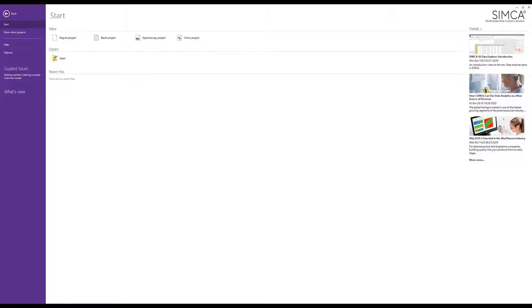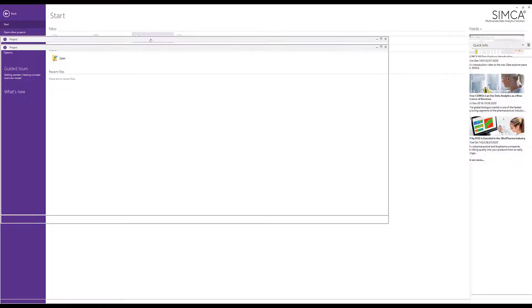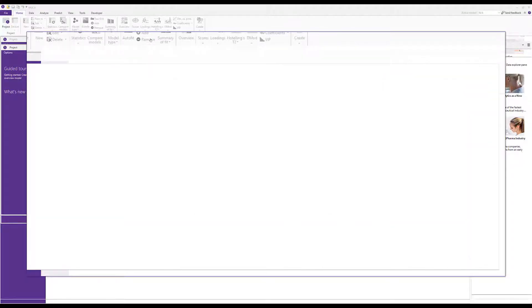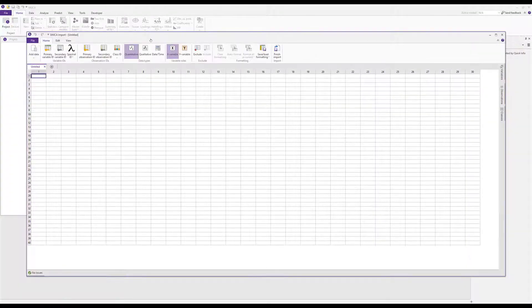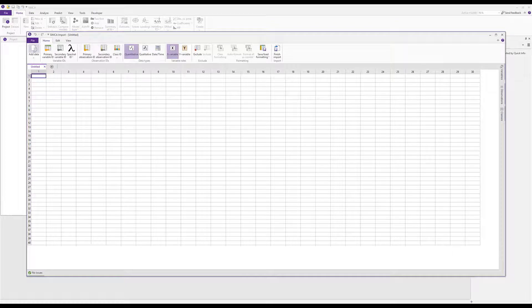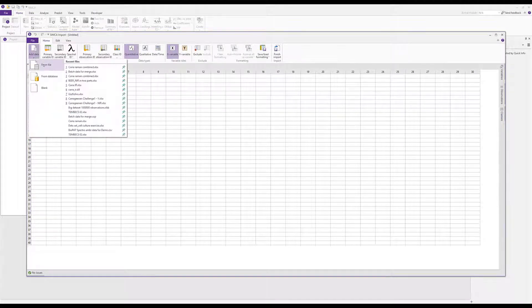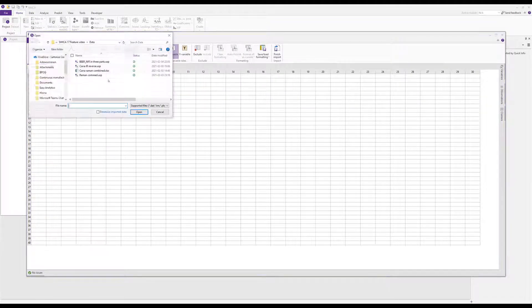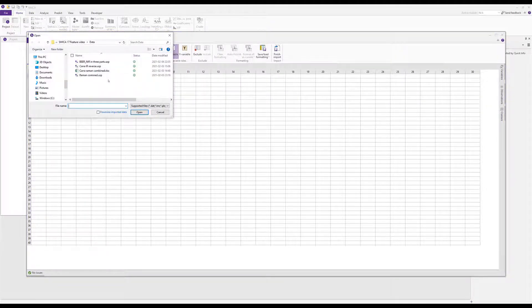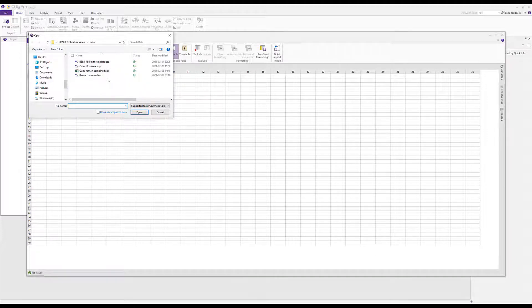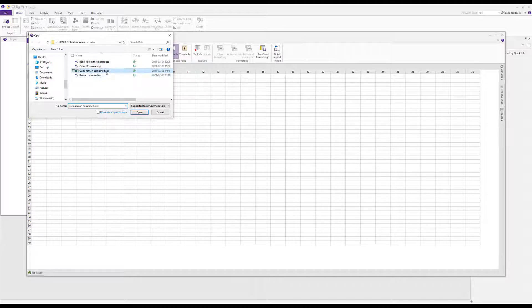Spectral data can be imported in many ways as multiple files, or as in this demo, an Excel file where both spectra and concentration values are combined in the same file. We start spectroscopy project, look for our data file, and SIMCA will automatically list and be prepared to open any of the many file formats it supports. We select the Excel file and open.